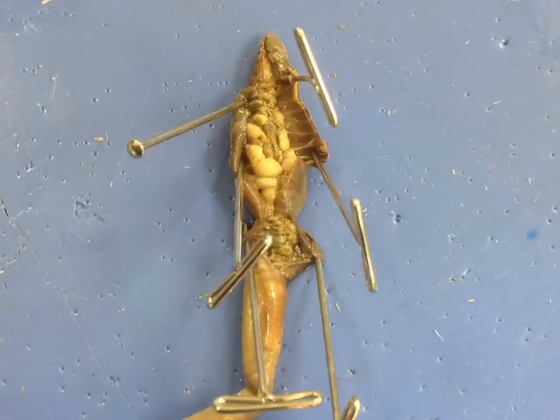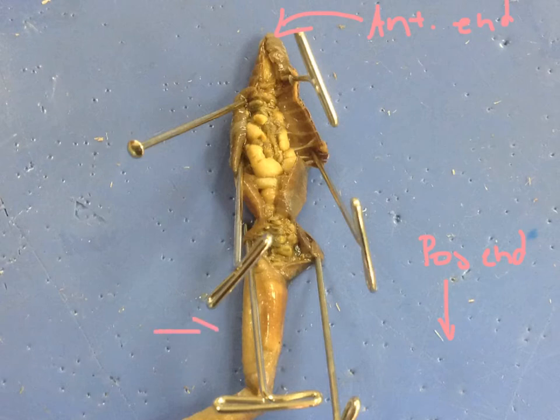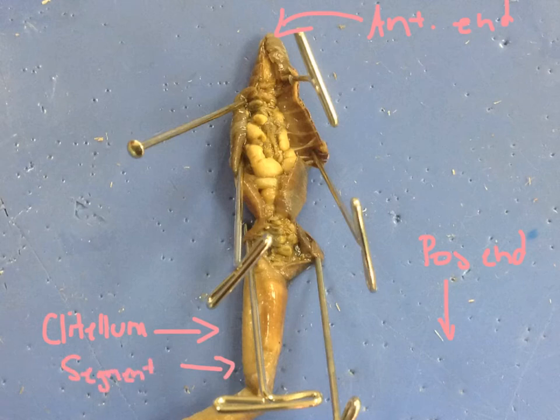The first part of the worm is the anterior end, which is the front end of the worm. The posterior end is where the anus is and where the earthworm excretes the waste. The next important part is called the clitellum. This is the tapish part of the worm. This is very important because it secretes the mucus to let the worm easily go through the soil. The segments are the lines you see on the worm, so they're basically everywhere. These also help it go through the soil.